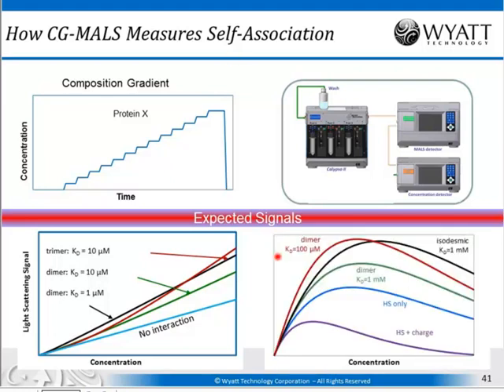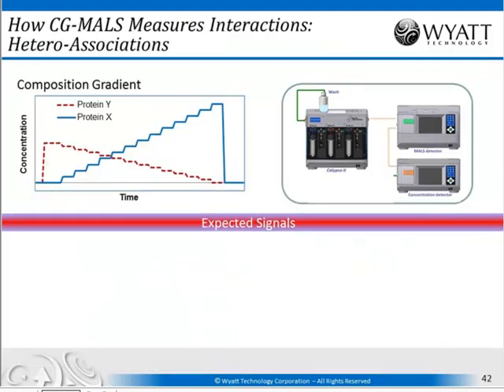If you're looking at high concentration formulations, things get a little strange, and so the light scattering intensity actually reaches a maximum and starts decreasing as you approach concentrations in the range of tens and hundreds of mg per mL. That actually gives you additional information. You can determine not only the association properties, but also the repulsive properties. For instance, if you have charge-charge repulsion, or hard-sphere repulsion, all of these are reflected in the shapes of these curves, and the data can be analyzed readily.